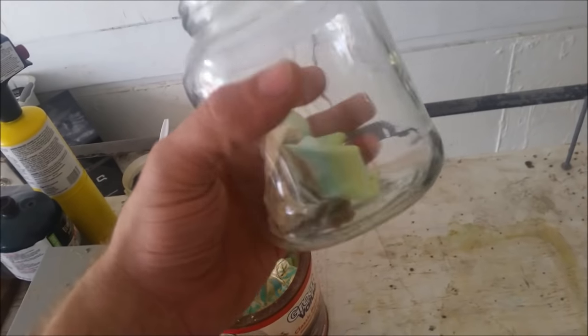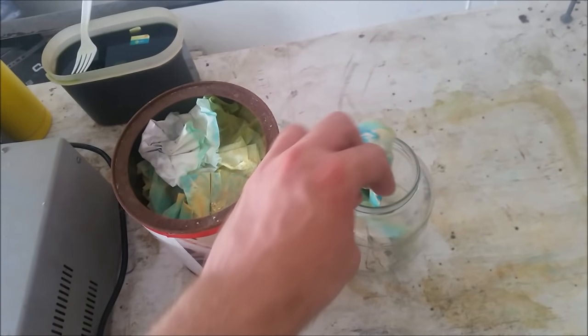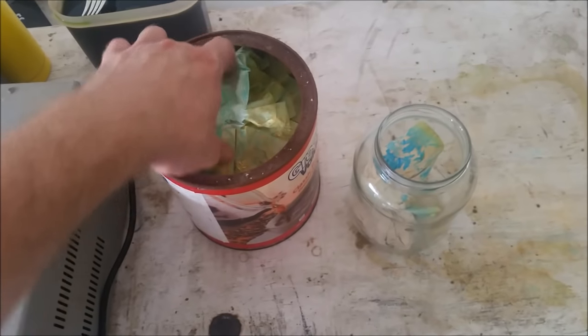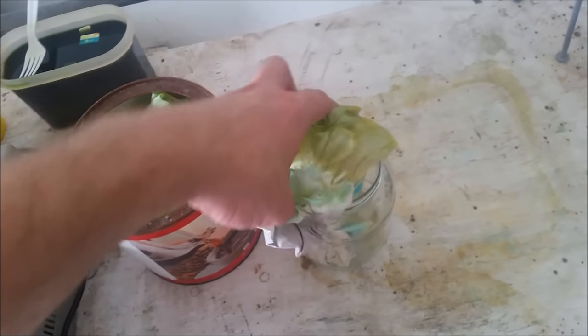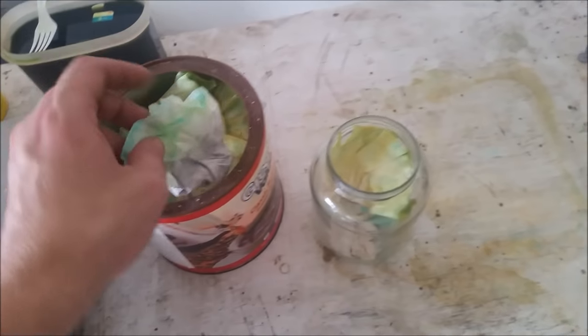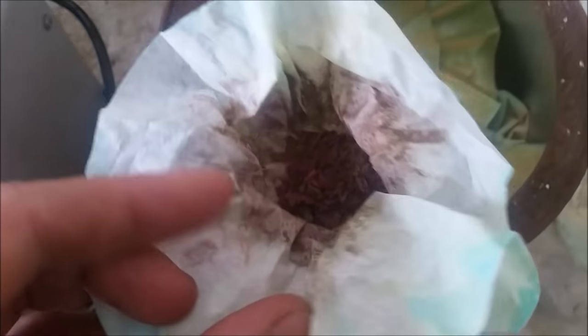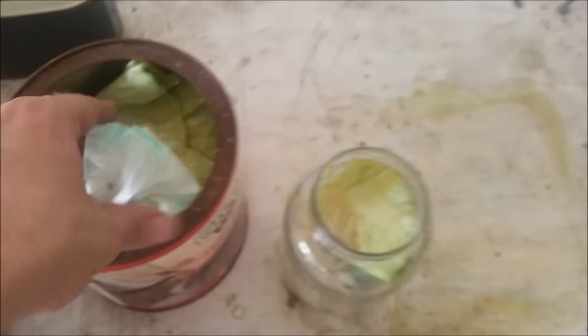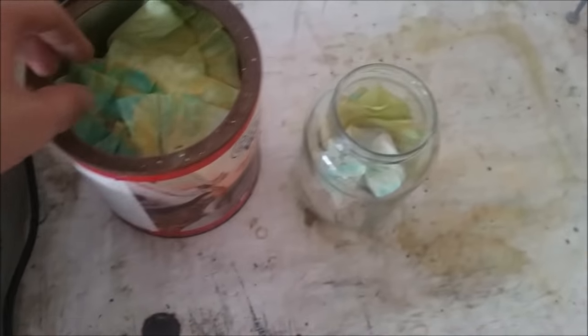And then once you start getting things down a bit more refined, you can switch to beakers. The first thing I'm going to do is stuff this full of these filters. I've been keeping these filters for a very long time, for years, just sticking them in here. This one is really heavy. That looks like primarily copper in there, which I expect — the majority of this to be copper.